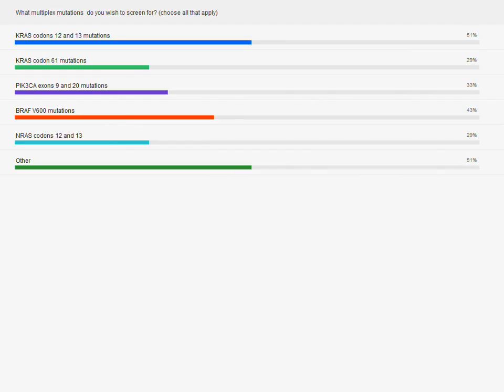So Dr. Shelton, would you like to briefly discuss this before we move on to the final part of your presentation? Well, it's excellent to see that KRAS 12 and 13 is highly selected. BRAF V600E is the one that I immediately was planning on working on next, so that's reassuring. And further multiplex assays are to be released in the next year.